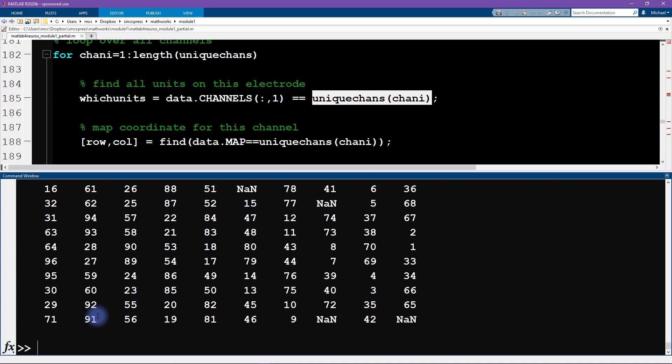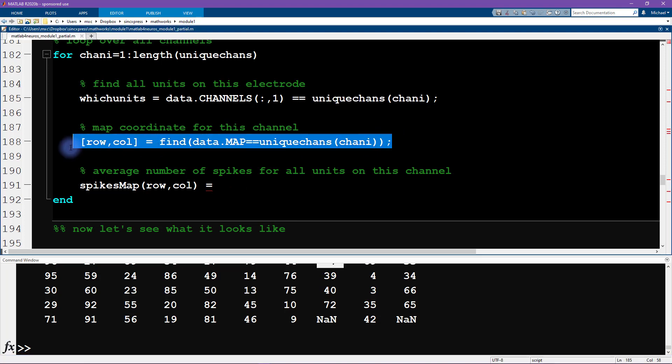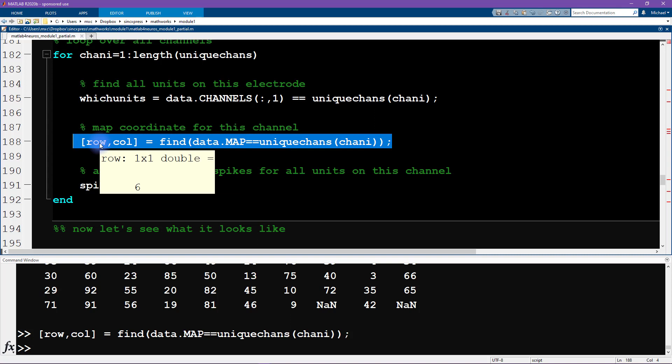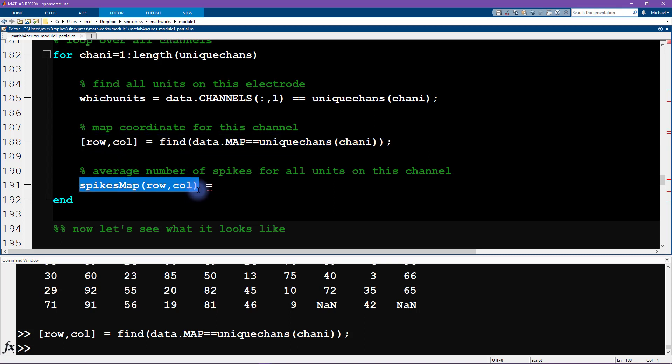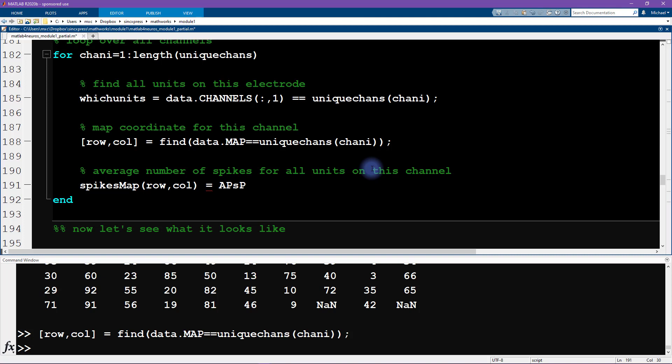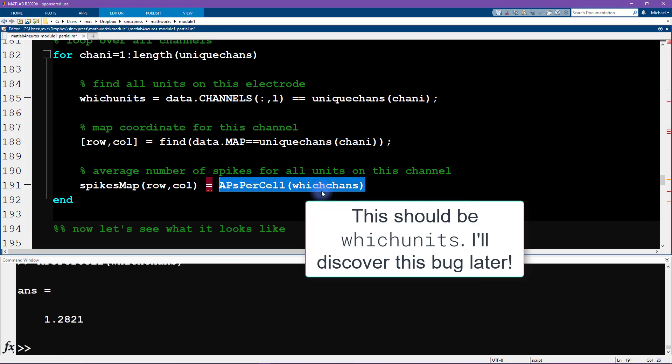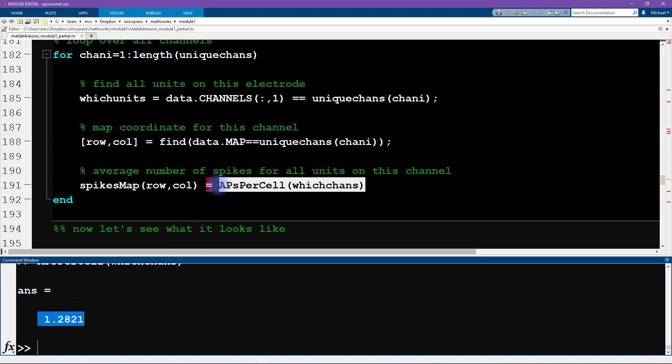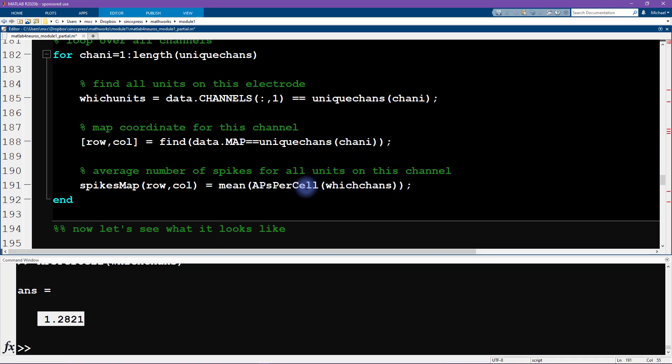Now we need to map that onto the physical location. So here is channel seven. So now we need to find out which row and column contains channel number seven. And that's what we do here with find. So we get find and the output is going to be the row and column index. So now we know that electrode number seven is in the sixth row and the eighth column. So then we can use that as indexing into this matrix spikes map. And then what we want here is the action potentials per cell from which chans. Now this could be, in this particular case with the first data channel, it happens to be that this is only one number because there was only one unit recorded from this physical channel. But of course, we want to average over all of these in the case that there are multiple neurons from the same electrode.